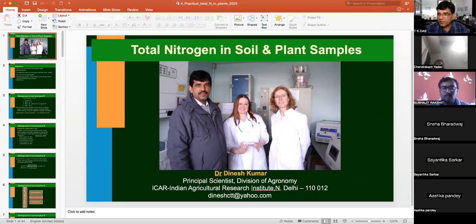Okay. Chandrakant, why do we estimate? What is the purpose? Why do we do it? Sir, for fertilizer application, how much fertilizer we apply? Okay. So he is giving an indirect answer. Indirect answer: to apply nutrients, to apply nitrogen, we estimate the nitrogen in plant sample.